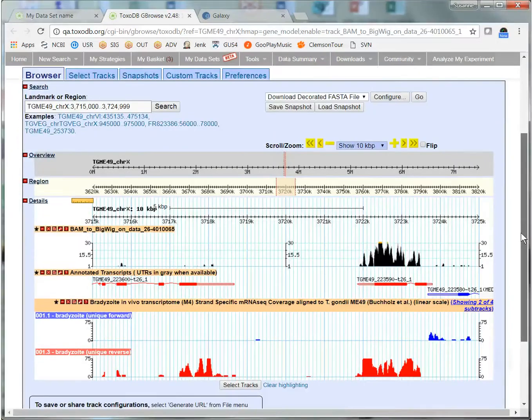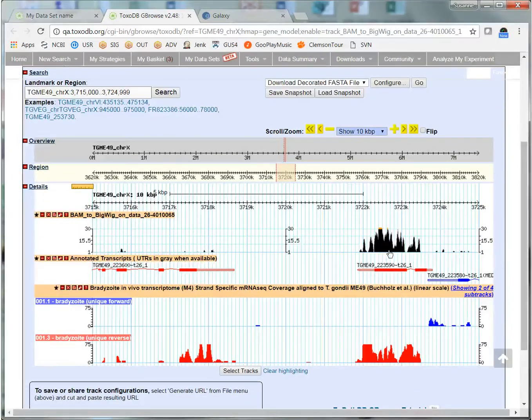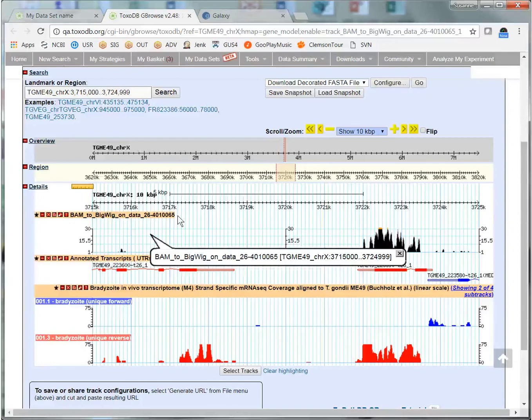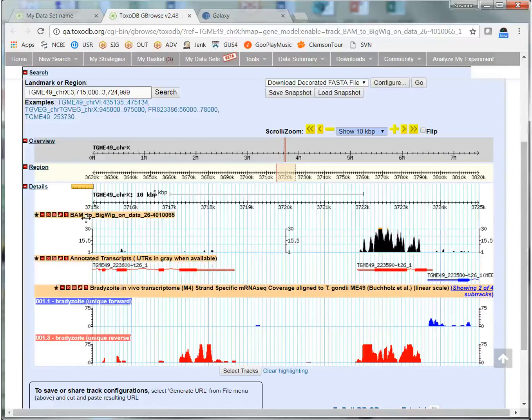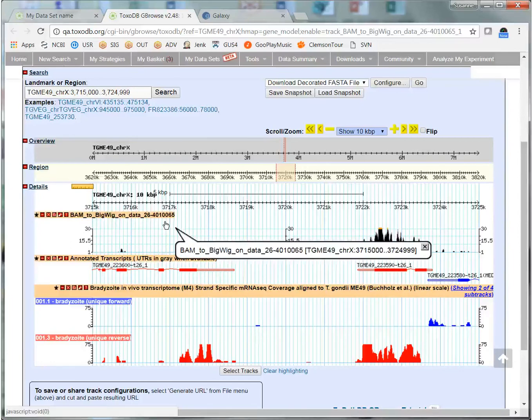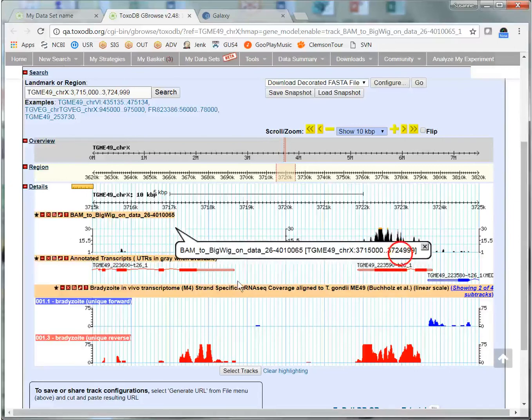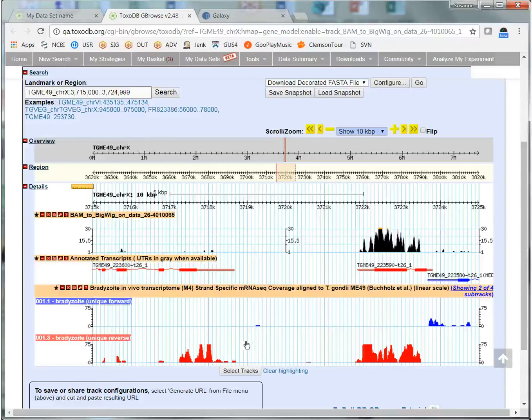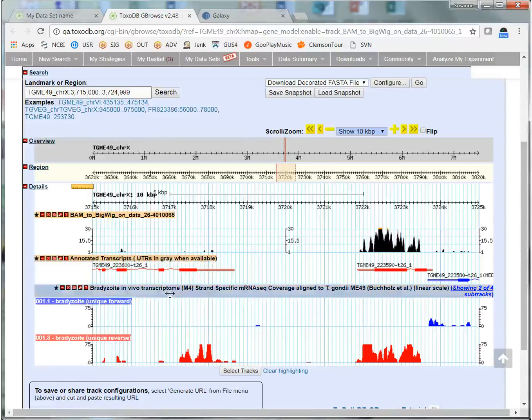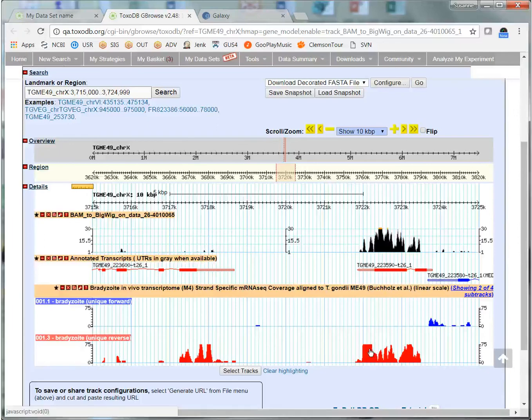Now I'm viewing my bigwig file. The name of the file is the same as what was in Galaxy. It is amended with a unique ID that was assigned to the dataset. And I'm viewing this data along with two other tracks that are publicly available in ToxoDB. The annotated transcripts track and some other RNA sequencing data that's publicly available in GBrowse.